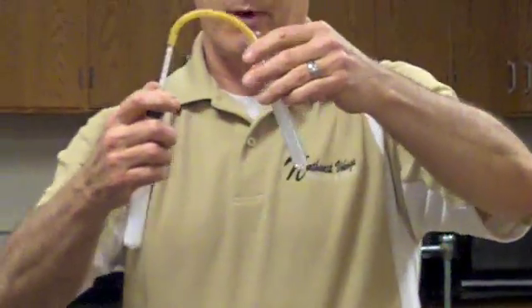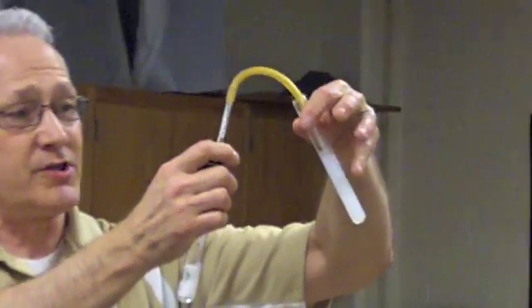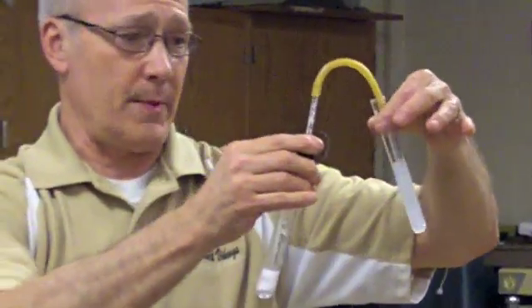And if a carbonate is present, which we do have, it should bubble through the liquid and turn it a cloudy white. So we can see there is a precipitate forming here. This is what carbonates do, and this proves you have a carbonate.